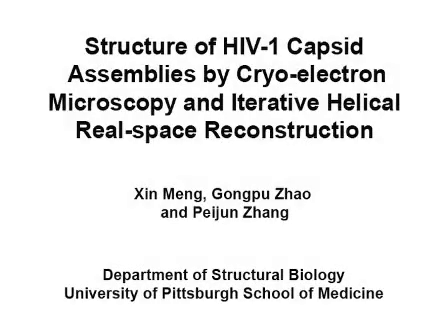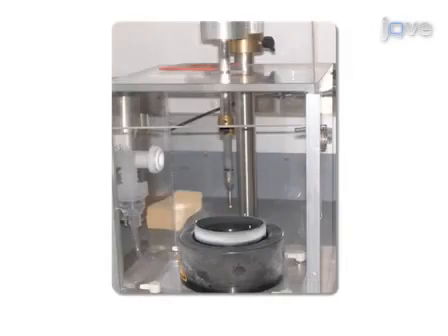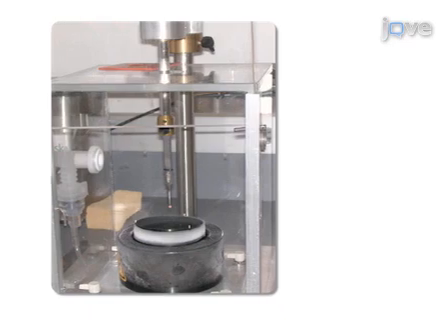The overall goal of this procedure is to provide a method to obtain a three-dimensional structure of helically assembled molecules using cryo-electron microscopy. The protocol begins with cryo-EM specimen preparation, using a rapid dilution and backside blotting method to transiently reduce the salt concentration when preparing the frozen hydrated EM grid.